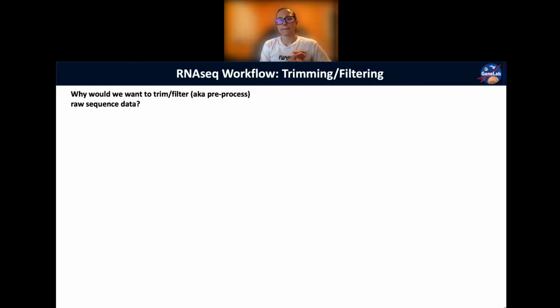What do you mean by that? You can unmute your mic. Oh, just that you don't really need all the excess code, the line. You just want either the gene you're interested in or just the part of the gene that actually tells you what you want to know. You don't need the beginning or the end. Why wouldn't you need the beginning? Because there's probably a lot of unimportant or useless base pairs in the front that just need to be trimmed. They don't really code for anything.